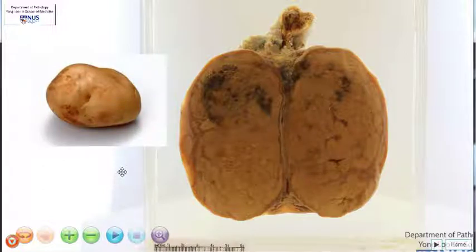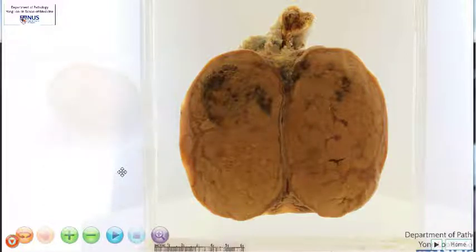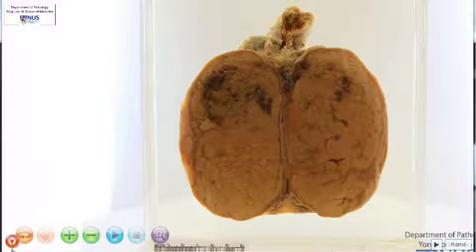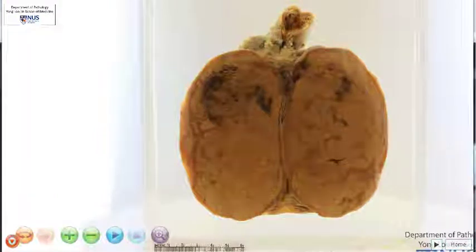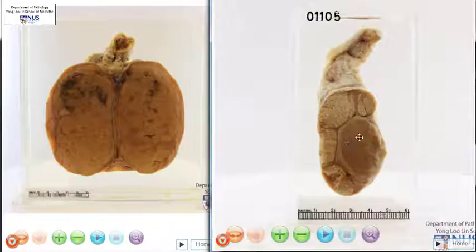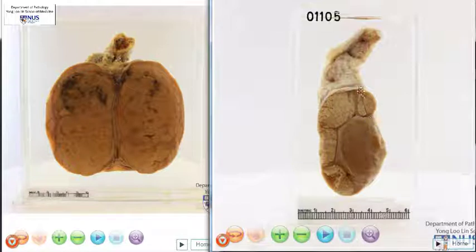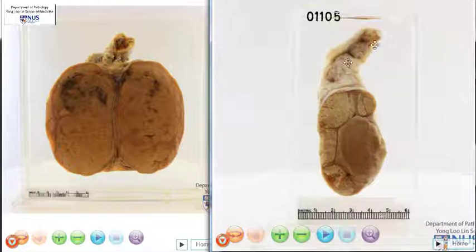Now let's contrast this with a different testicular pathology. On the right, we also have an example of a bisected testis. This is the epididymis, this is the testis itself, and this is the spermatic cord.